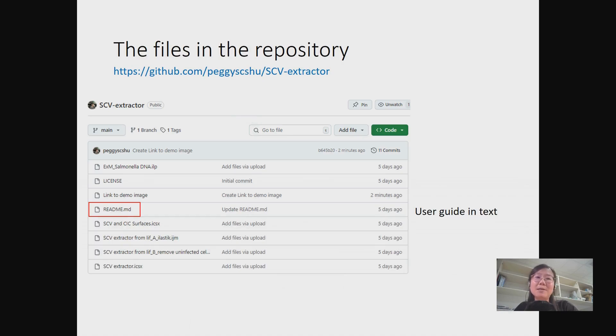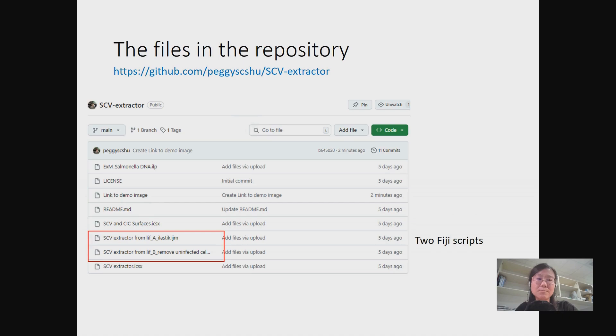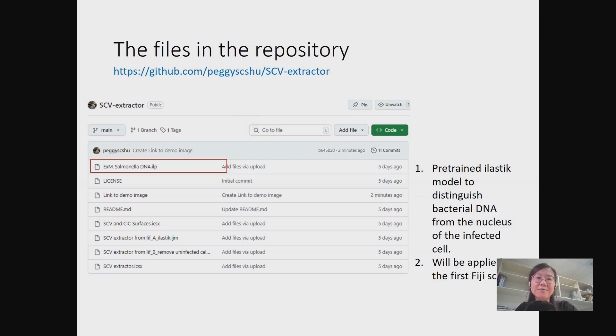Now let's see what we have in the GitHub repository. Before the usage of SCV Extractor, please read the readme file first. Here I included the command line for installation and the usage. Two Fiji scripts are included to be executed by Fiji or ImageJ. One pre-trained Ilastik model is offered here to distinguish the bacterial DNA from the nucleus of the infected cell. That will be applied in the first Fiji script.